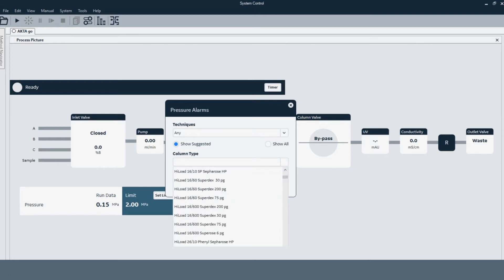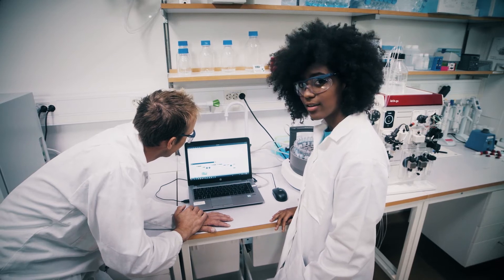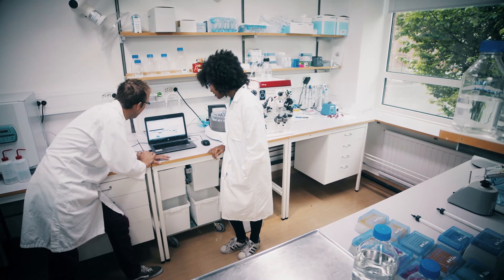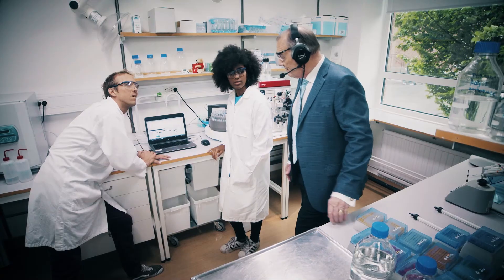Column pressure limits? You set them easily or just import from the column library. You get an estimated remaining runtime, which means you can get on with other things while EctaGo is purifying your proteins — you just have to show up at the end of the run. All in all, the process picture gives you intuitive access to all essential information and necessary functionality.